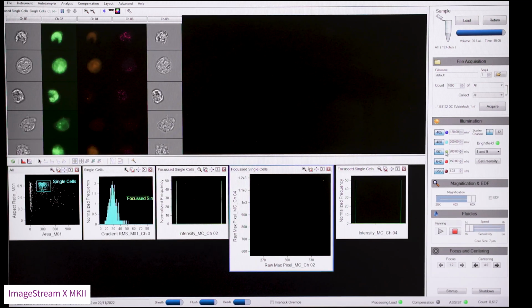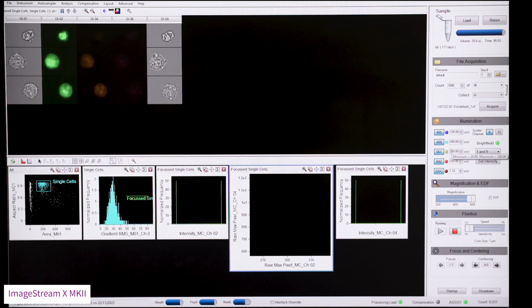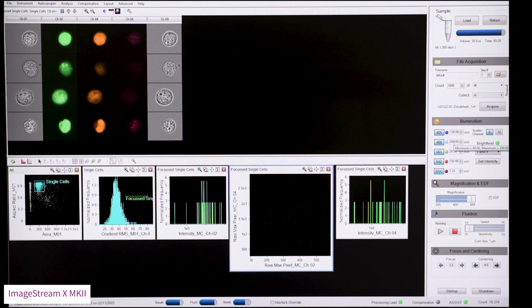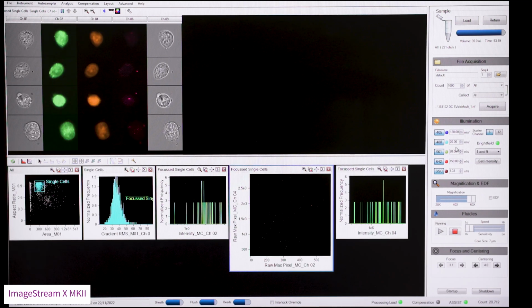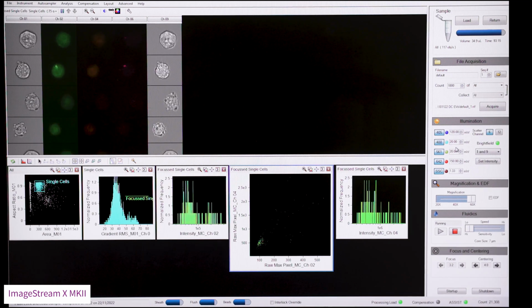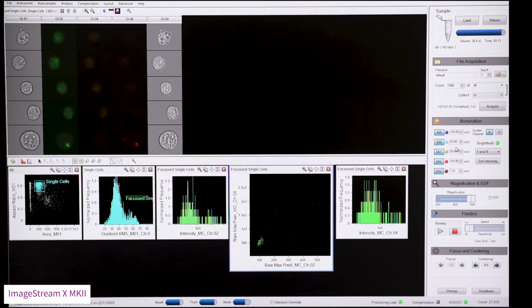So I know that we're going to need to reduce the laser power, and this dye is best excited by the green laser, so I will begin to reduce this one. Reduce it in steps until you reach the minimum power. In this case, they're so bright that we'll also need to reduce the blue laser, as PI is excited by both lasers. As I reduce the blue laser to 20 milliwatts, the data becomes on scale.